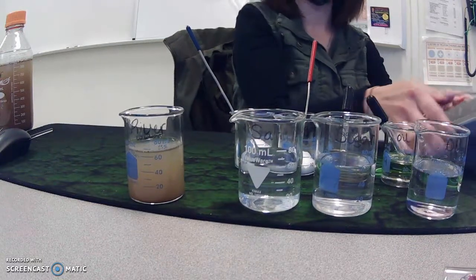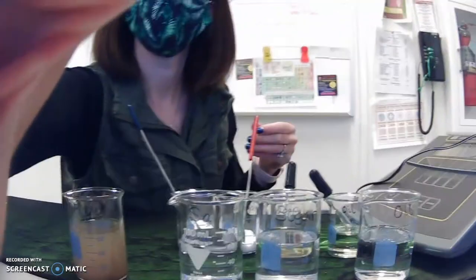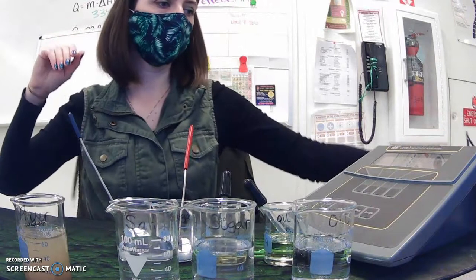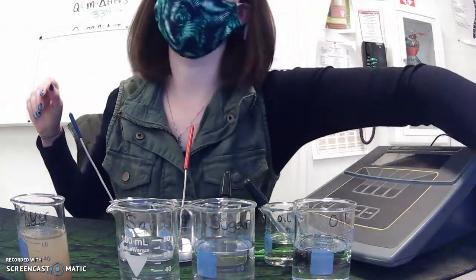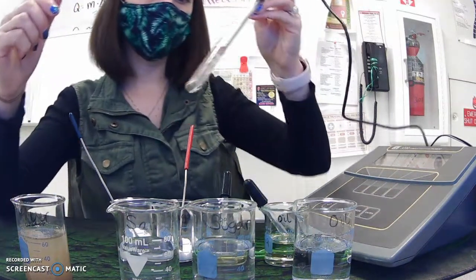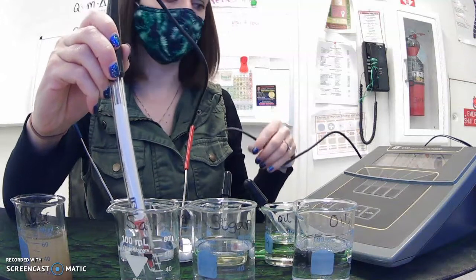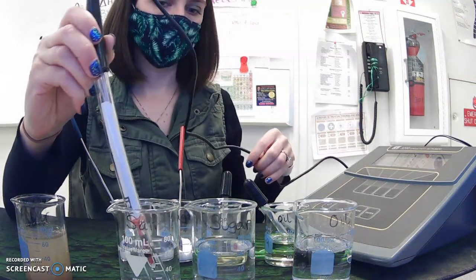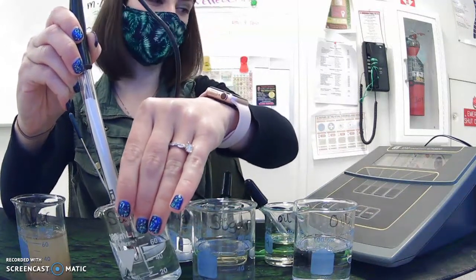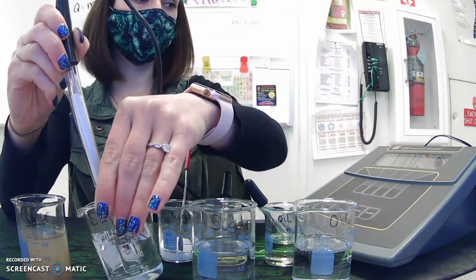So we have our system over here that we are going to use to test. It's zeroed out currently, and then I'll show you what it comes out to. As we add our conductivity meter into our salt solution, there's not much salt in it, so it might not be very high. 0.99.